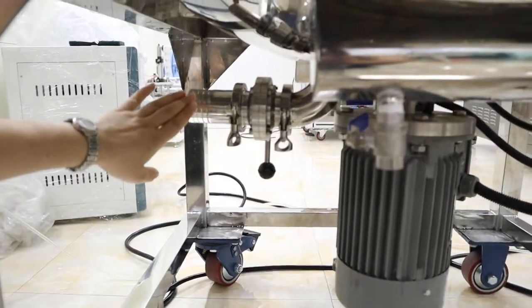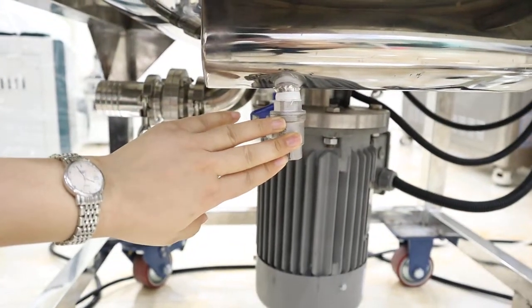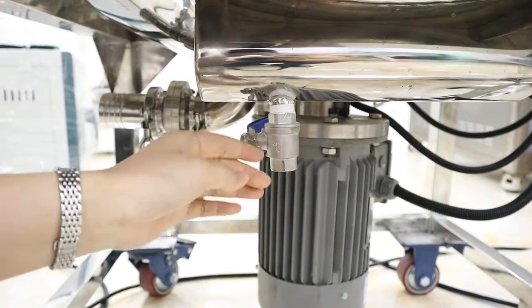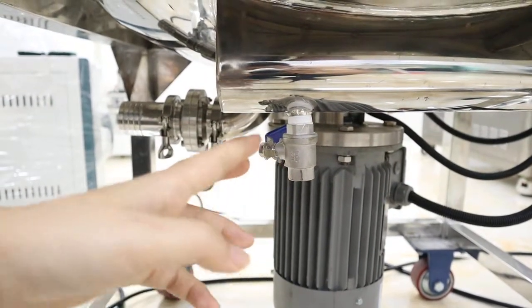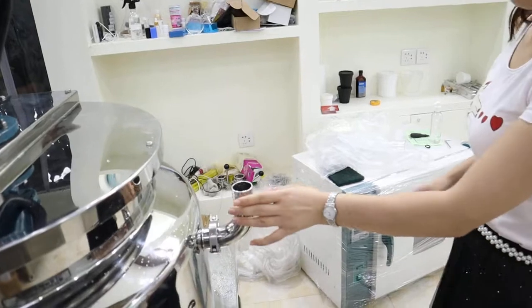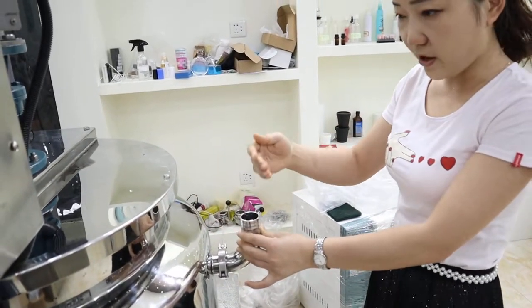Here, this one is the outlet and this is connected with the water. This water is for injected heating water. You can connect it from here and it will come out from here. The water from the jacket can come out from here.